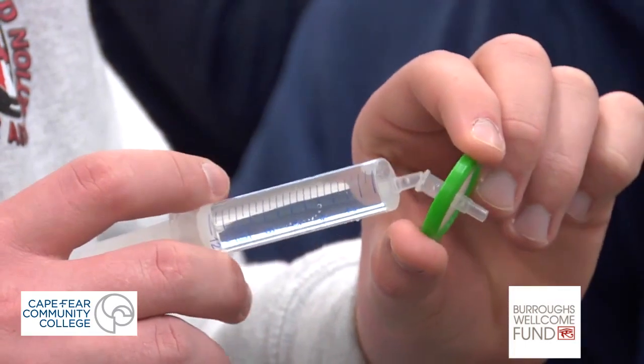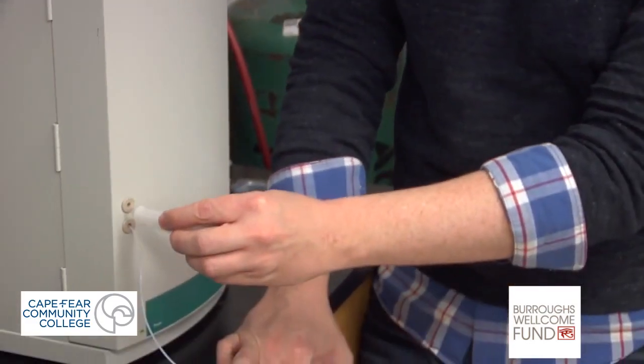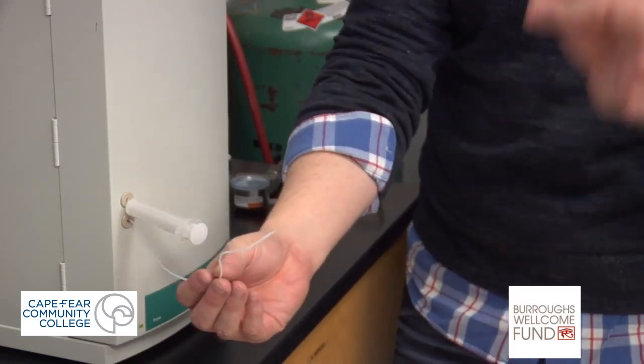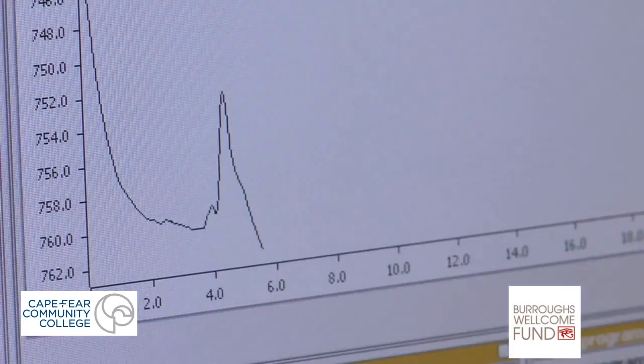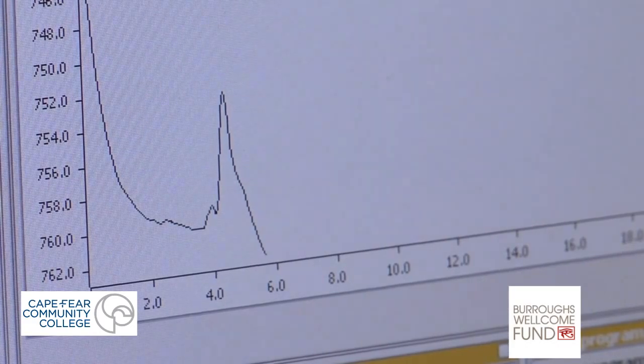I think that Fiji and Smart Water may have more minerals in them because they say they do, but also the other ones don't claim to, or they don't claim to have a lot. So it's also, if you buy more water, is it going to have the same amount? We'll take the syringe and we'll put it here into this top outlet, and this piece of tubing will go down into your water supply. It's definitely going to be different than distilled water and tap water and stuff. I feel like there is going to be a greater number of minerals in the other water. Some of these will be so large that I could see them with my own eyes on the computer screen. Other times they'll be really, really tiny.